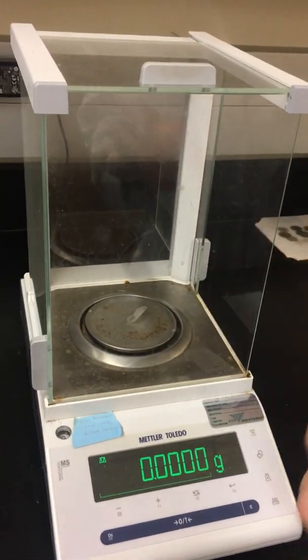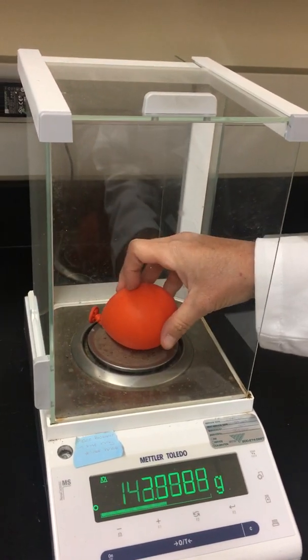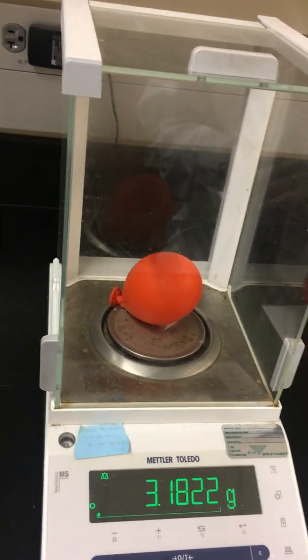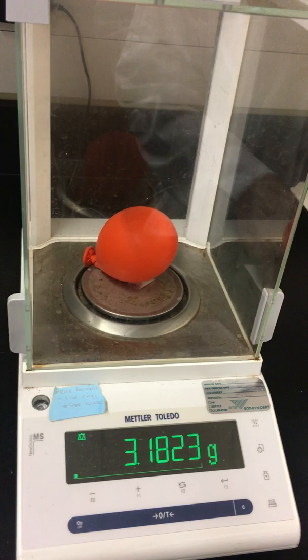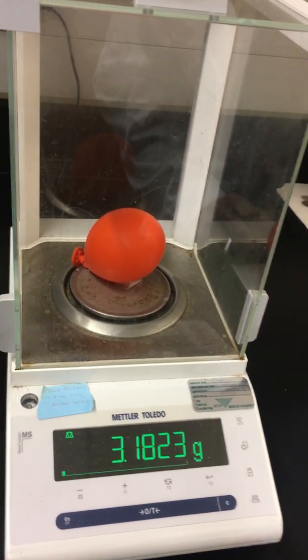It's zeroed. Now we'll add our balloon to it. The mass of our balloon is now 3.1823 grams.